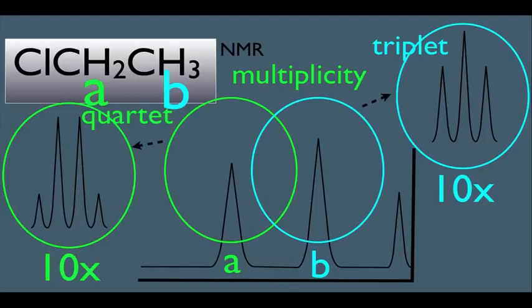The peaks split due to something called spin-spin coupling. We'll go deeper into this a little bit later. Another term we should know is that the A and B hydrogens are considered coupled hydrogens. And coupled hydrogens have a tendency to split each other's signal, or peak. Now, that's definitely a lot of orgo jargon here. Like I said, we'll get down to details a little bit later, but let's at least learn how to predict the splitting that would be observed given a molecule on its NMR spectrum.